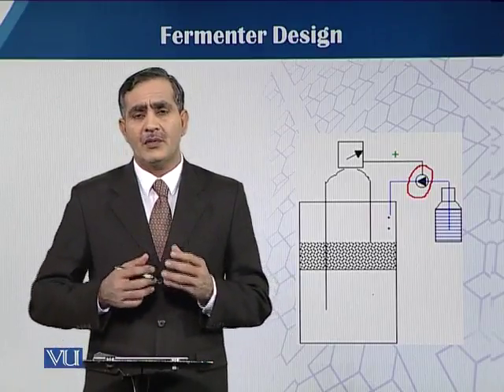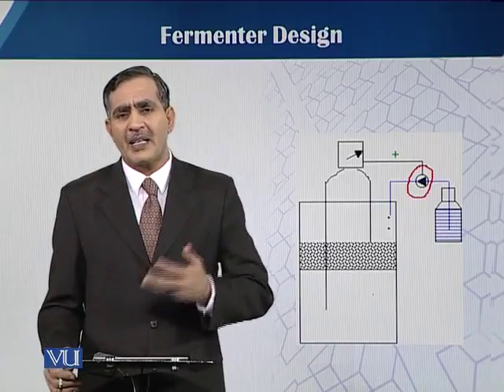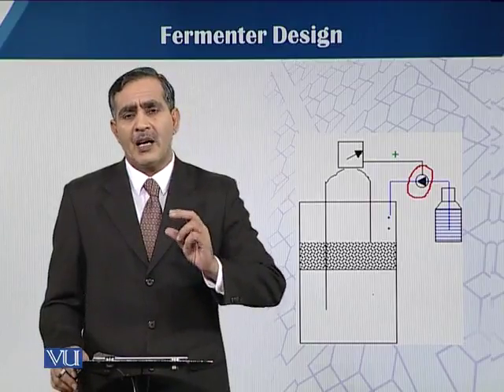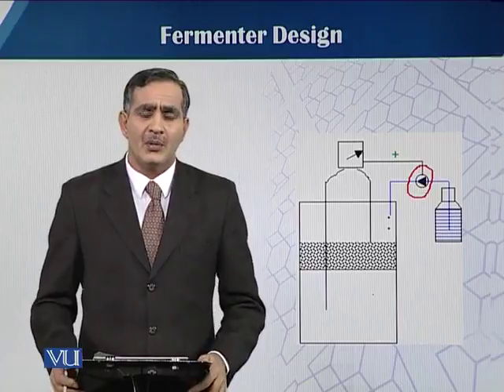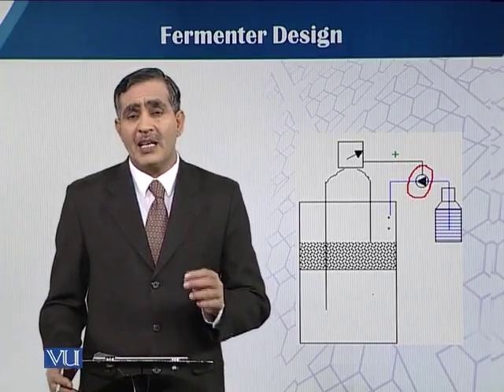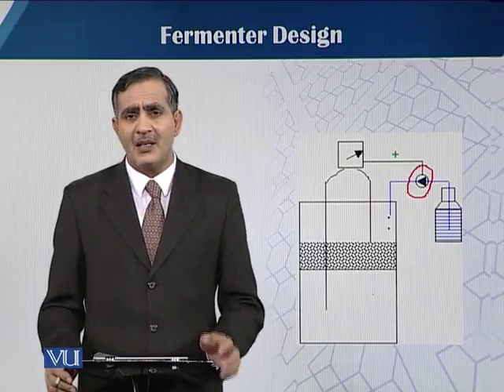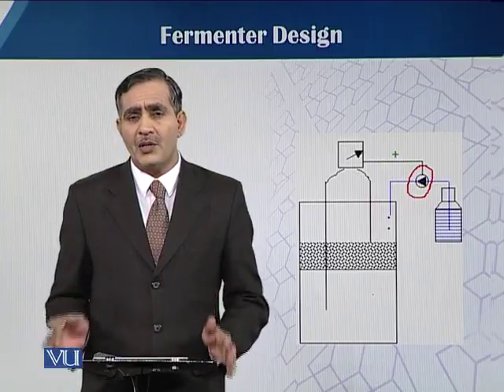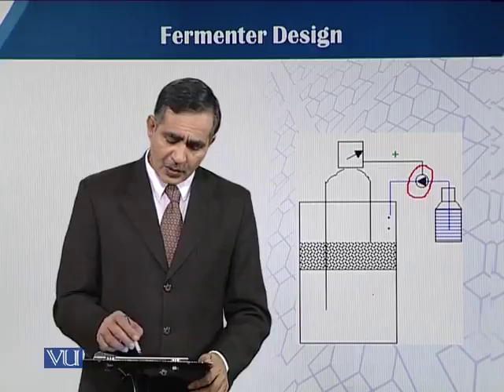But when we use this wet on and wet off system or level probe, sometimes in fermentation there is a practical problem, because the whole fermentation process is aqueous. Sometimes vapors are produced, and when the vapors touch the upper level probe, they give a wrong signal to the pump, by which the anti-foam addition becomes a constant process. So we have to be very careful in such cases, when there is evaporation and wet on or wet off conditions with vapors touching the probe and giving wrong signaling. So this is a limitation while using the automatic anti-foam control system, and we must be careful about foam control with it.